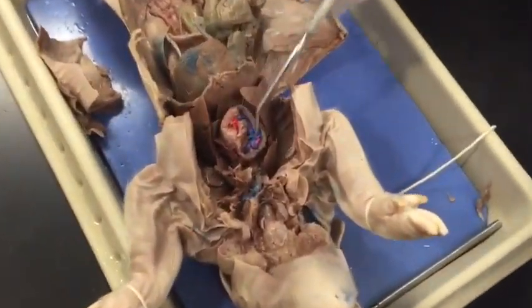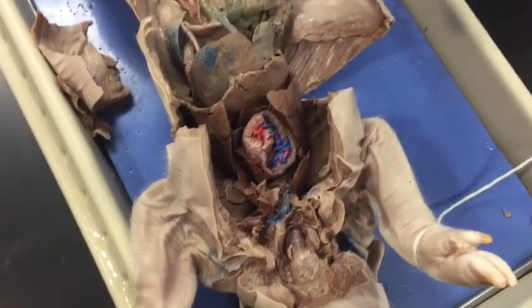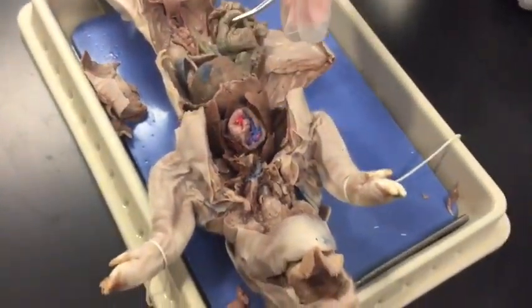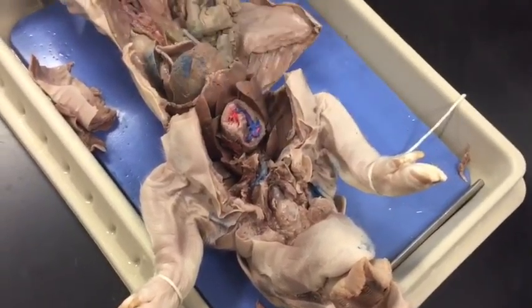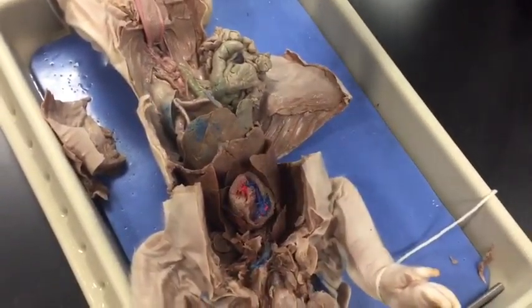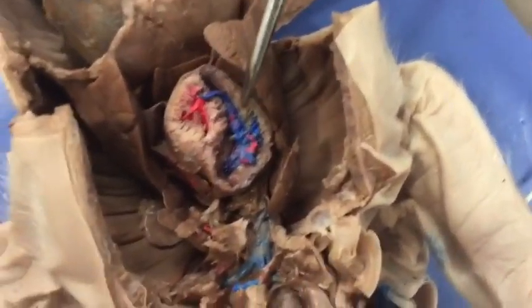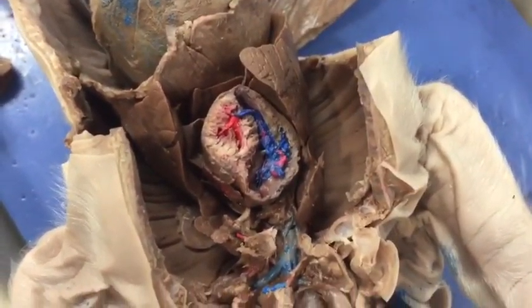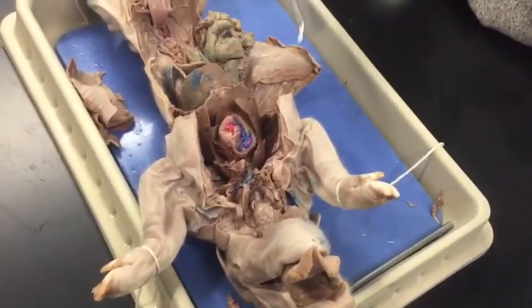So here is the heart. It's in between the two lungs, so the lungs kind of cover it, and then the ribs are over that. The heart pumps the blood throughout the body, and the veins carry the blood from organs to the heart, and then the arteries take blood out from the heart. Here you can see the artery, and here's the vein. The coronary artery supplies blood to the heart muscle, which helps it pump.